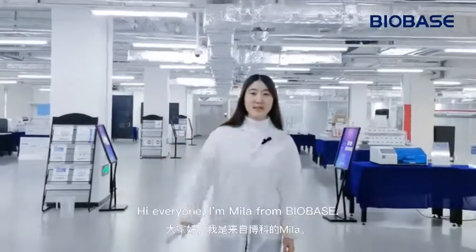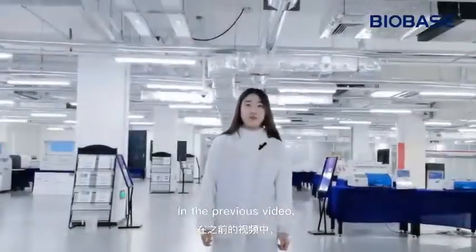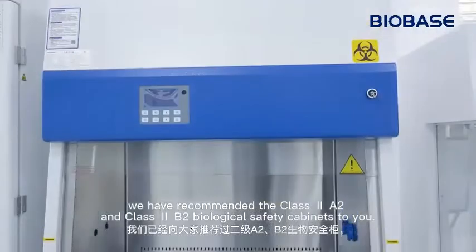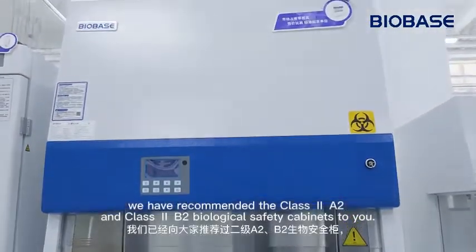Hi everyone, I'm Mila from Biobase. In the previous video, we recommended Class 2A2 and Class 2B2 biological safety cabinets to you.